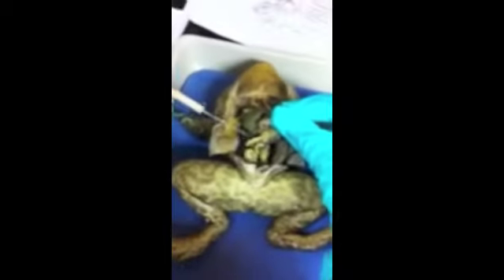The function is to digest food into nutrients into the bloodstream through the villi, which increase the surface area and the capacity to absorb nutrients and the food and liquid that pass through it.